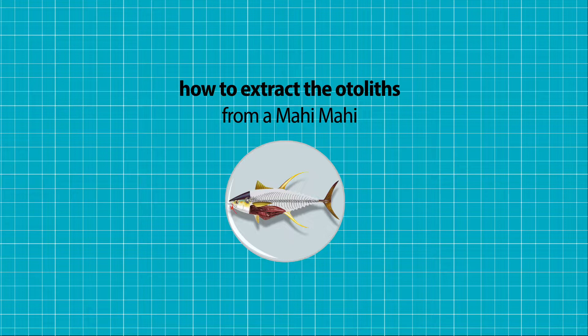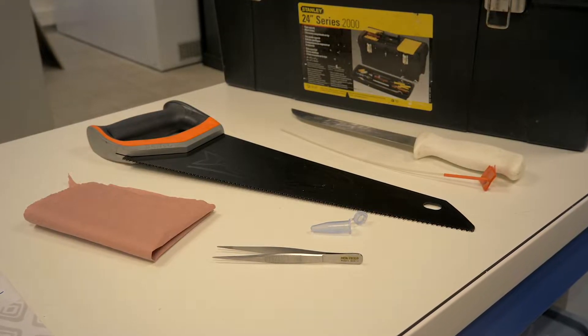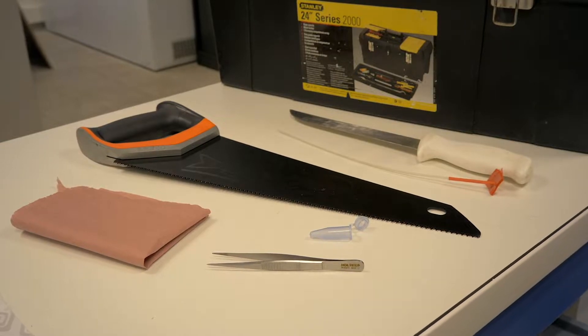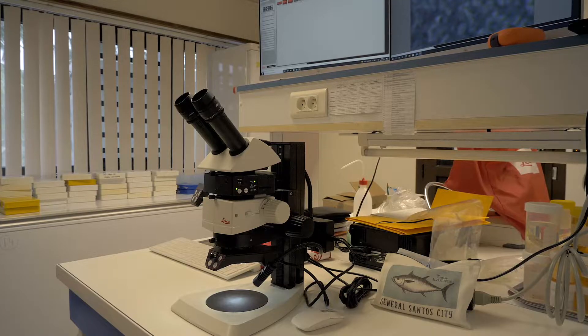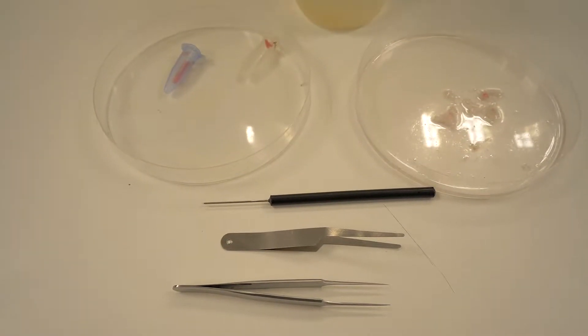Today we're going to learn how to extract the otoliths from a mahi-mahi. We're going to need a saw, tweezers, a vial, a label, a knife, and gloves. Afterwards, to fully extract the otoliths, we will need a microscope, a needle, and soft tweezers.